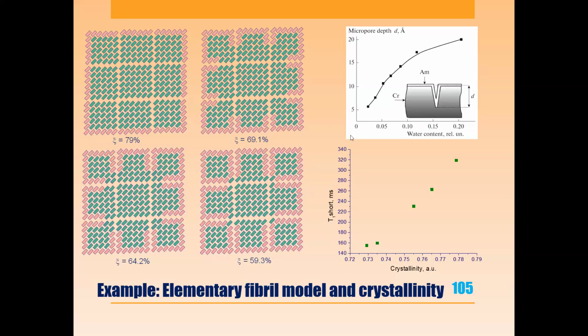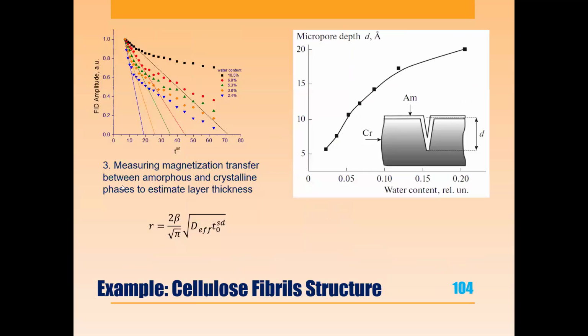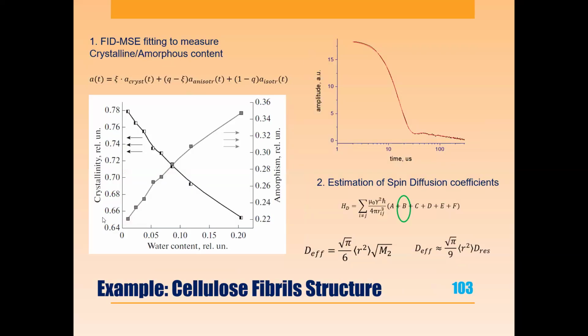When we are wetting the sample, water molecules try to penetrate inside the pores, and the content of the amorphous phase is rising. You can see it right here.